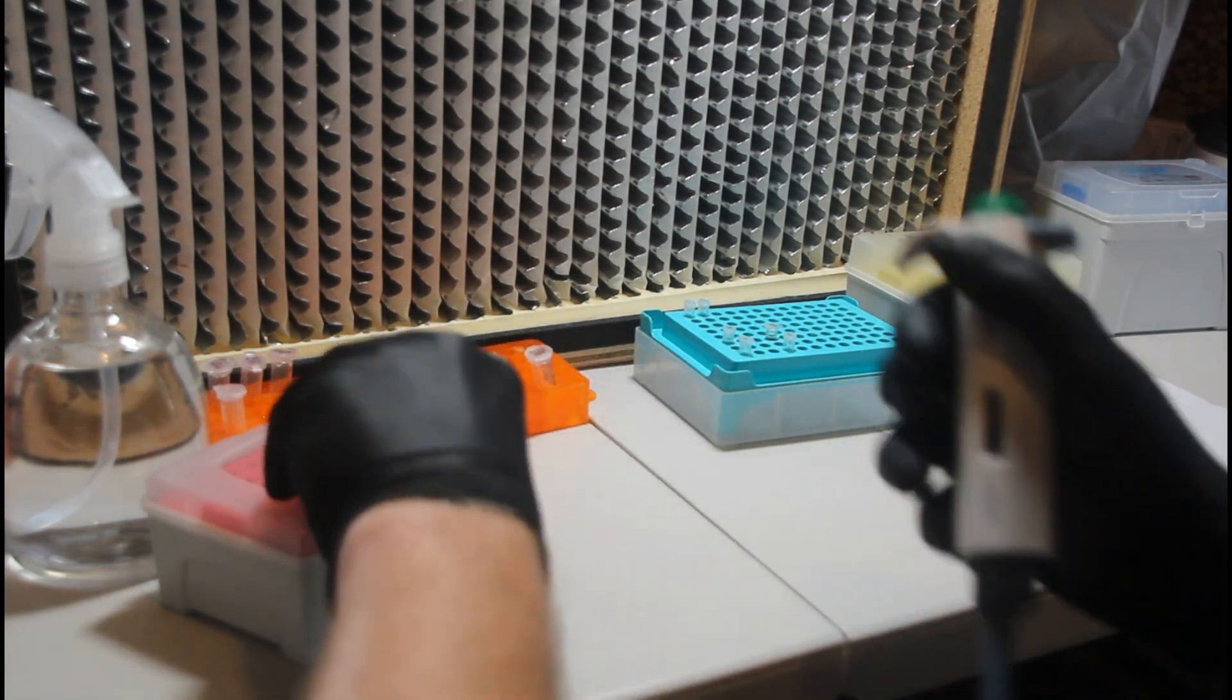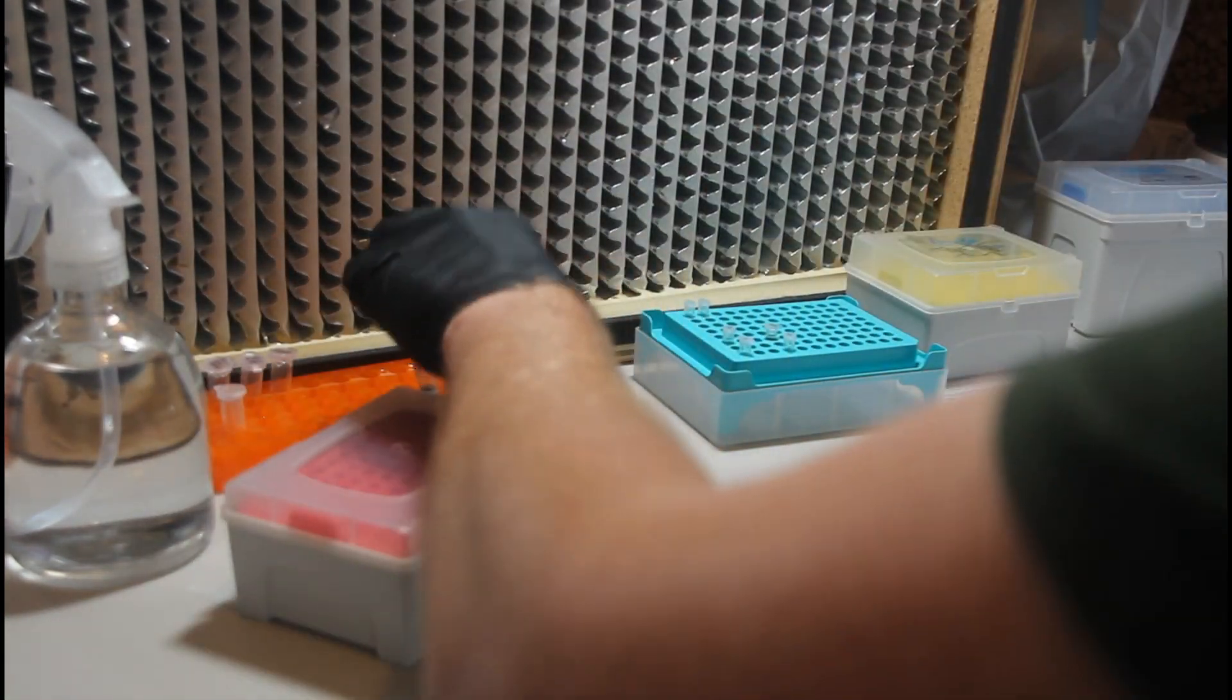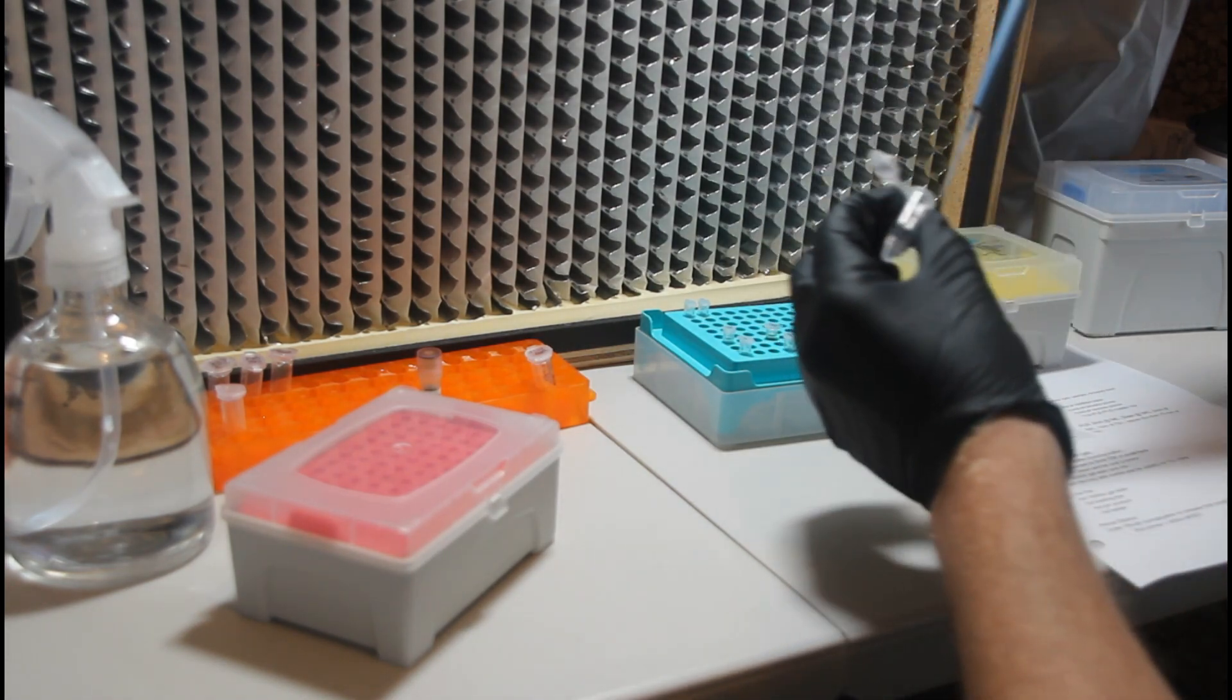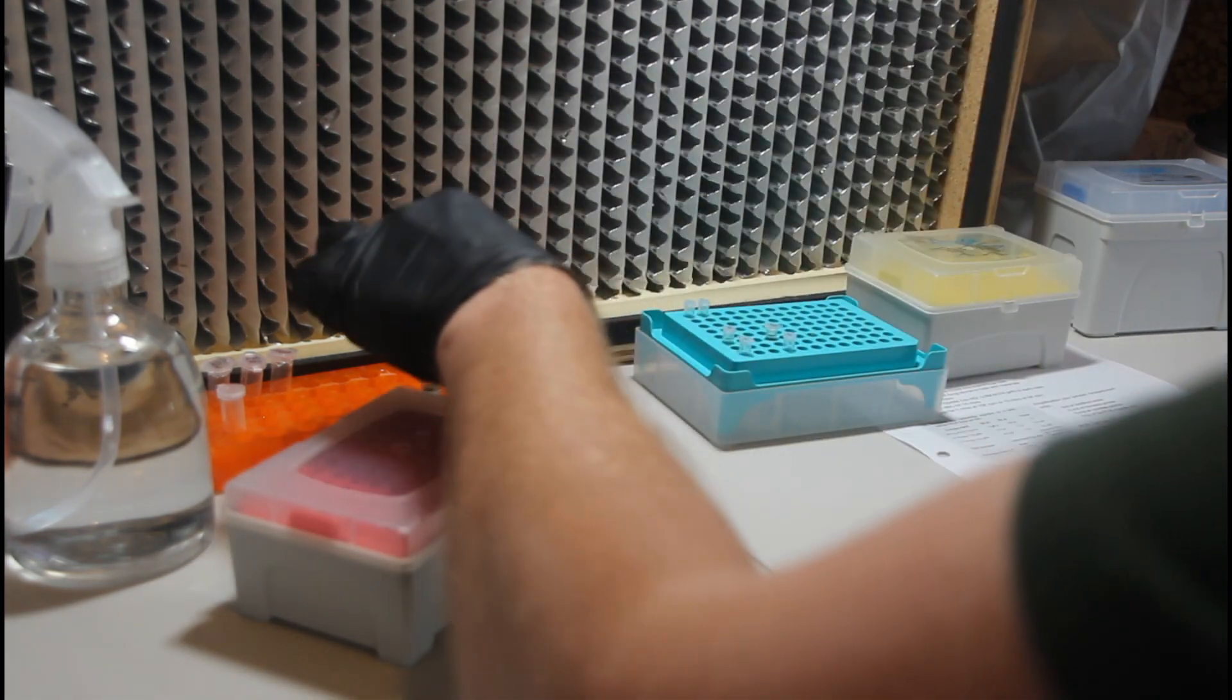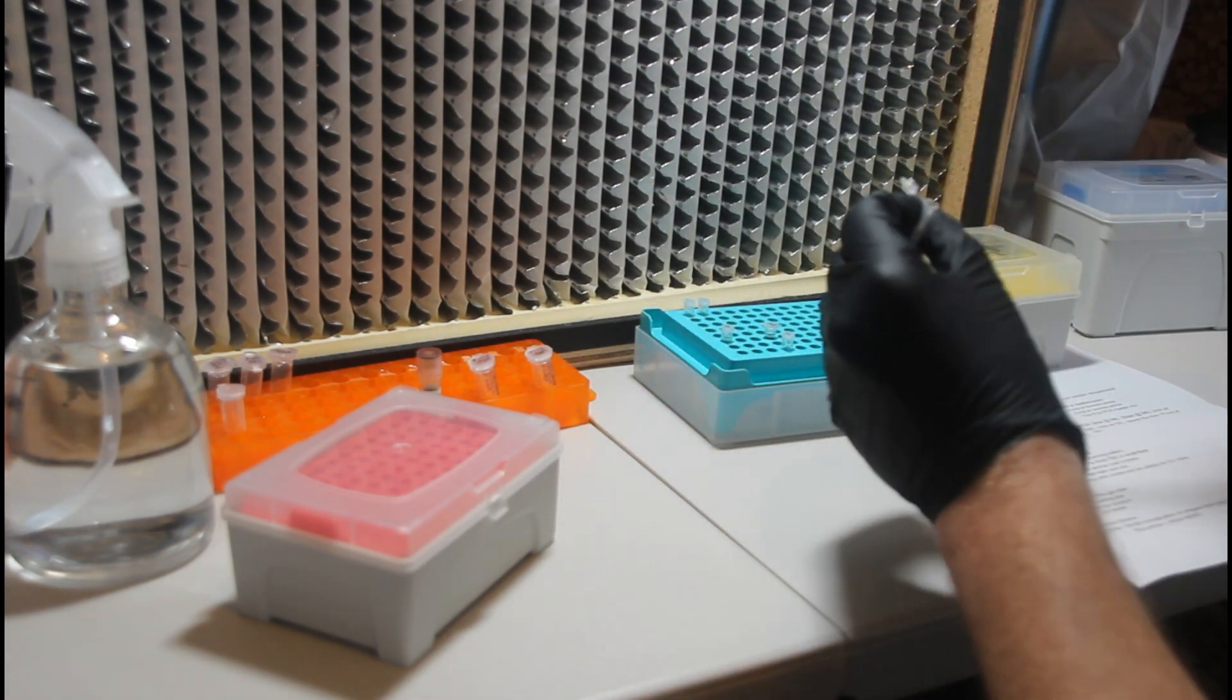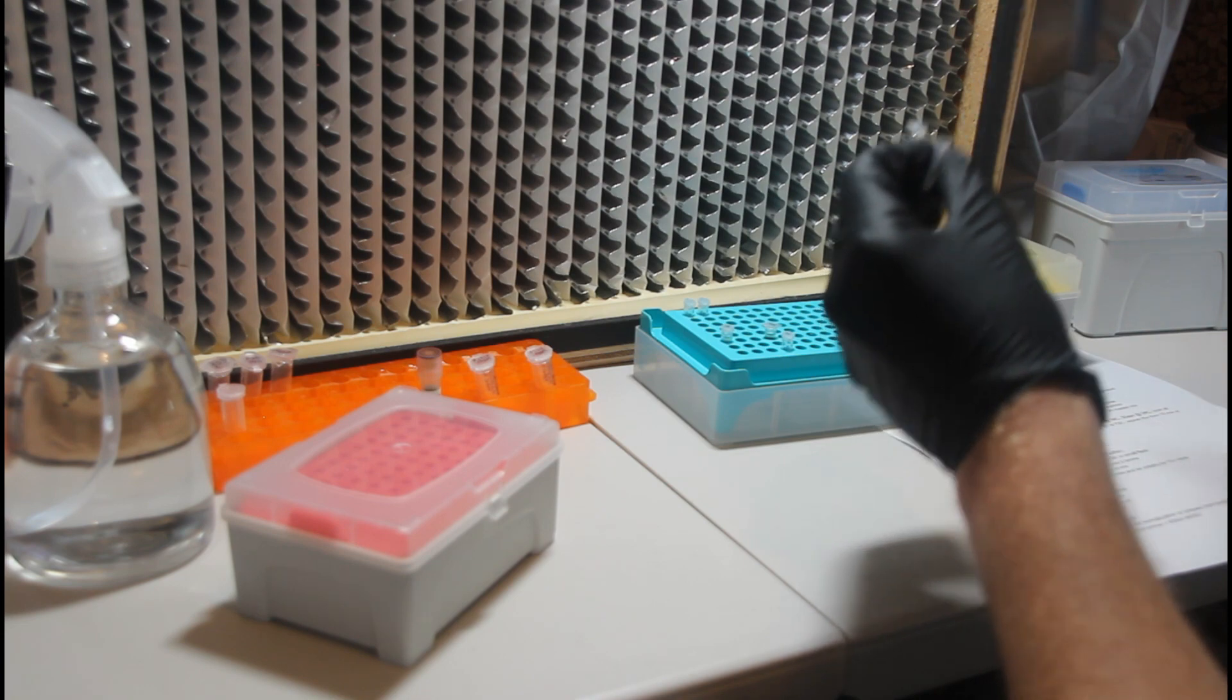Now it's time to add the forward and reverse primers. So you will want to use a new pipette tip for each one of these as well. And for the forward primer, we're going to add 0.5 microliters to each of the tubes. And for the reverse primer, we're going to use the same amount, 0.5 microliters of the reverse primer in each of the PCR reaction tubes.